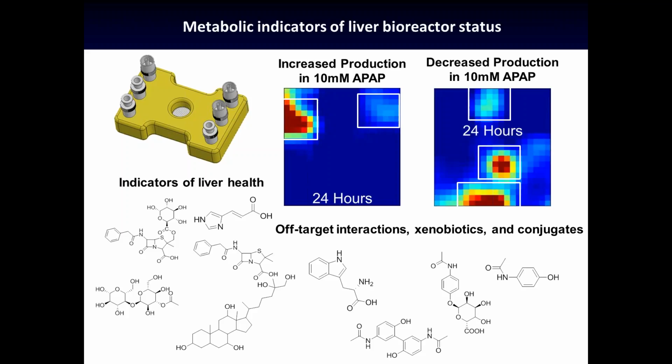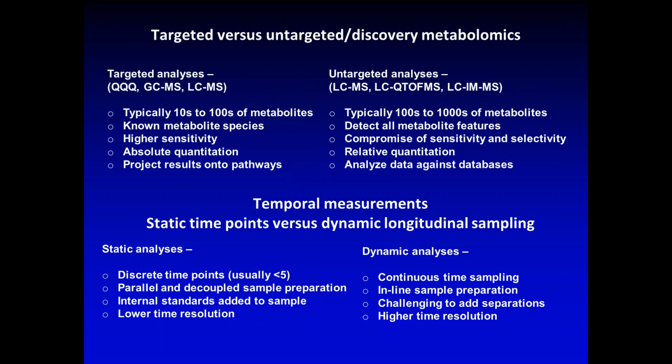We see things like drugs, small molecule conjugates, and a large number of other types of molecules. But in this discovery-driven approach, it tells us which are those other molecules that are guilty by association that might not be known biologically at present. But when we find those clustered around things like dysregulated molecules, we can find what are the secondary and tertiary effects in the health impact of the drug or toxin.